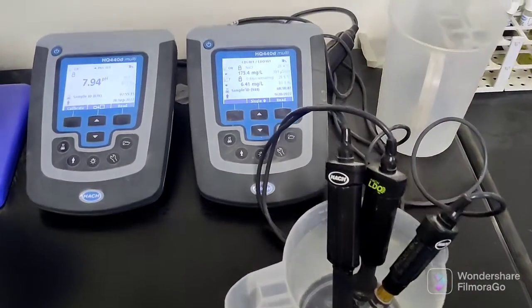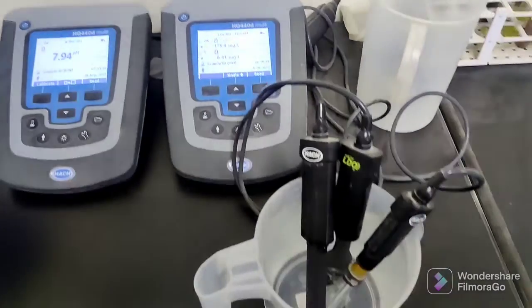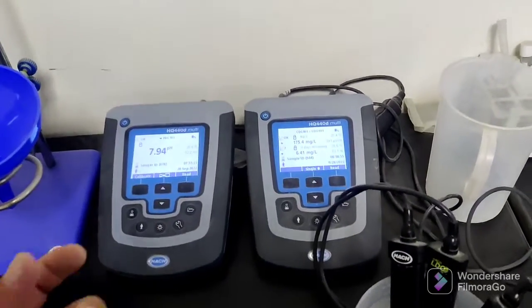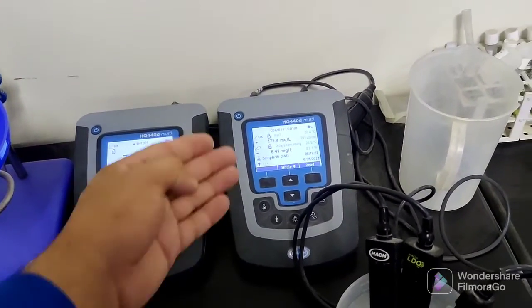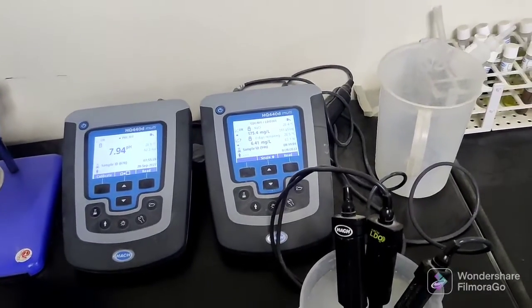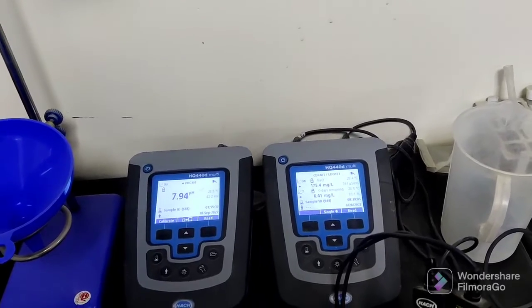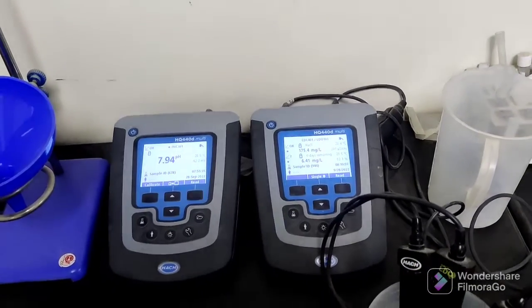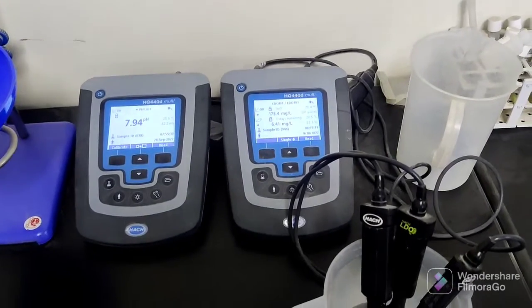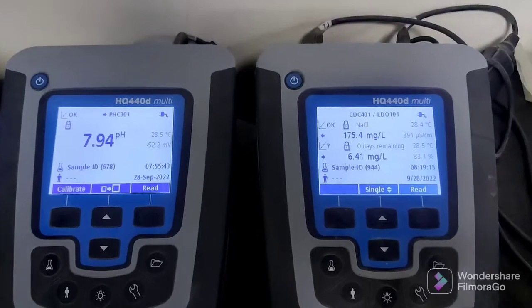So this is our indoor pH meter. You can bring a sample of water or anything you want to check — the pH, dissolved oxygen DO, and also the conductivity. If you are using water for construction purposes, like a wastewater treatment plant or any water treatment plant, you can check everything very well on these meters.